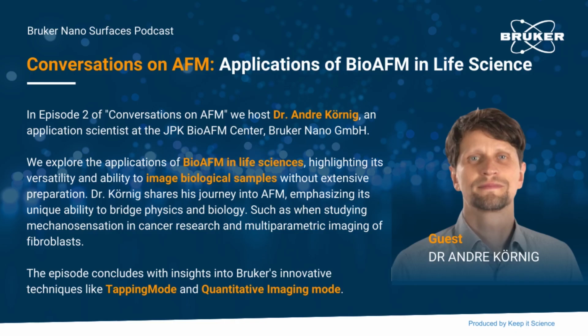And then there is also PeakForce Tapping mode, which Bruker got very big on and developed. It's a similar mode to what I was explaining before. You can generate force curves out of your image, and this gives access to multiparametric imaging.